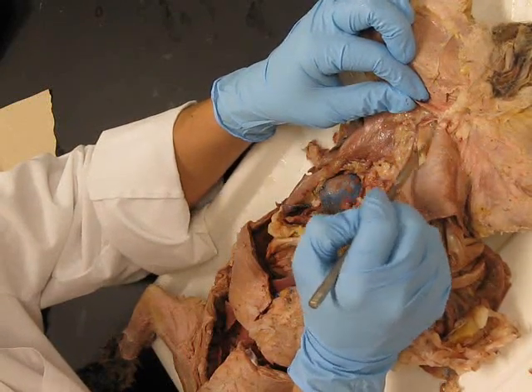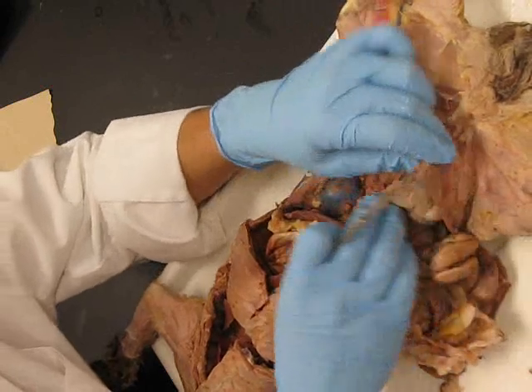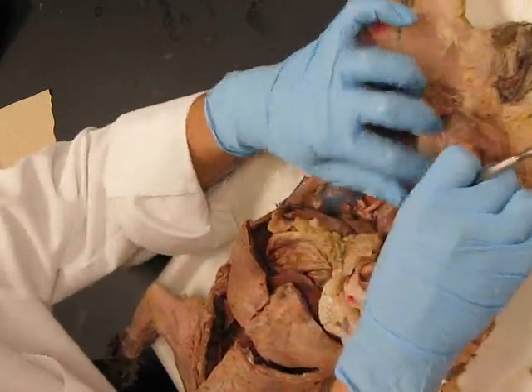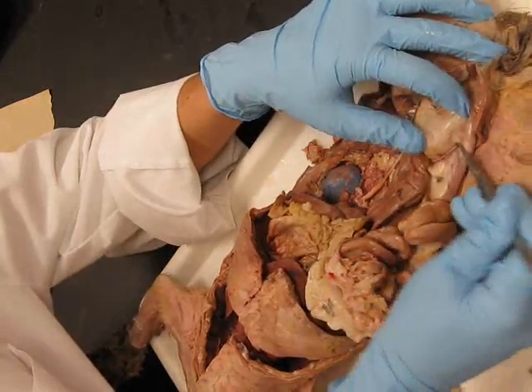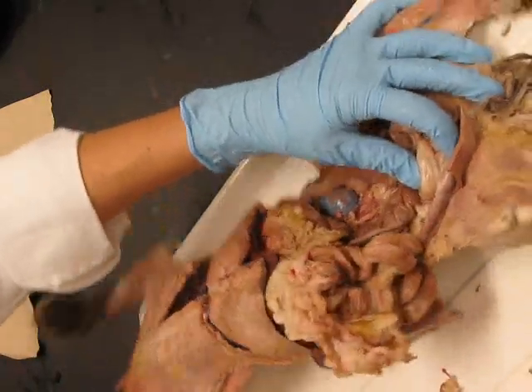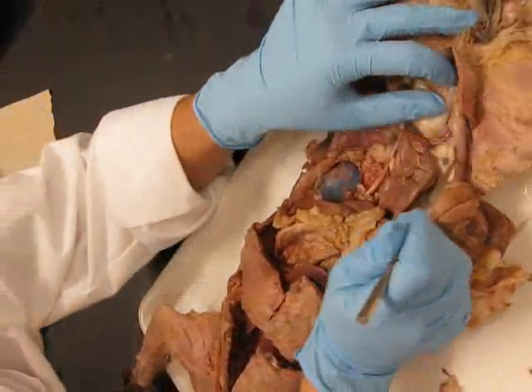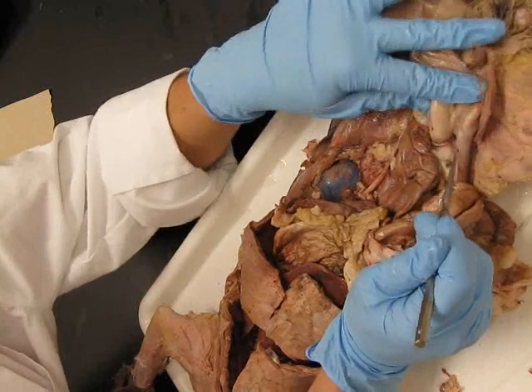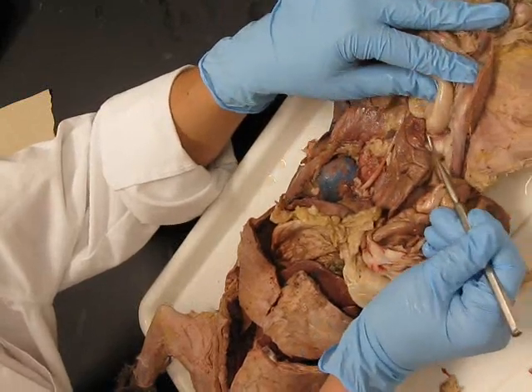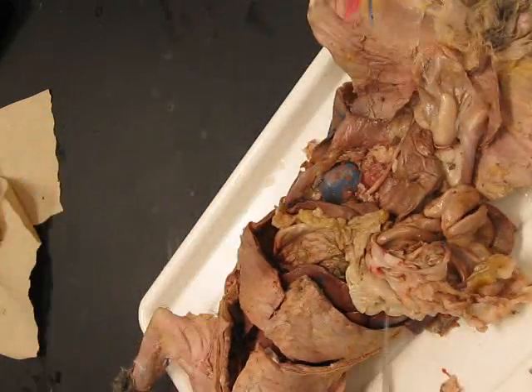And I accidentally cut this side when I did the urethra. Luckily, we've got two sides. So here's that inguinal canal on the non-dissected side. You can see how nice that canal is there. Okay. This white tube that's coming from that canal and looping back behind the urinary bladder is the vas deferens, this tube right here. Okay. And there should be one on each side.